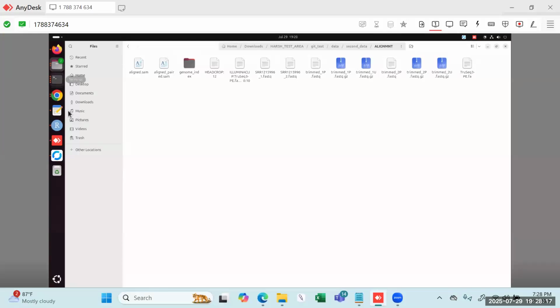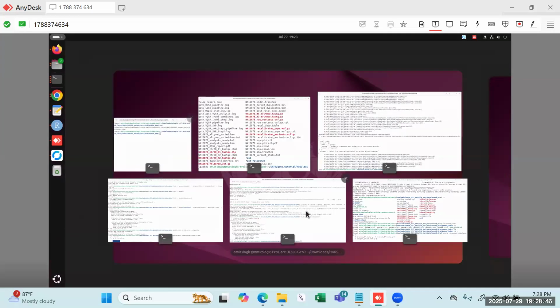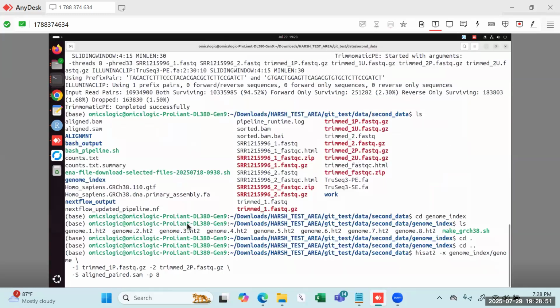After this is done, what are we going to do? We are going to convert it, because conversion is one of the steps. Here we are going to use SAMtools now. SAMtools will help us to convert it into the BAM version, and then it will help us to sort also. Sorting will be there, and we are going to create the indexing. So using SAMtools, this is again one of the tools that we are going to discuss. Let me open another terminal.